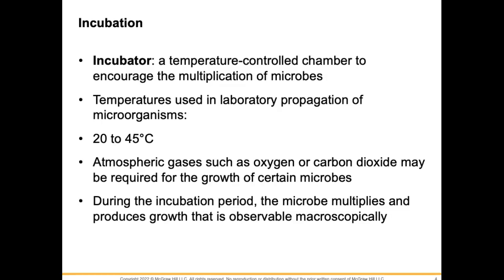We also determine the atmospheric gases that are needed for any given culture. It could be oxygen, CO2, just depends on what we're testing for. And during the incubation period, the microbes multiply and produce growth on or in that media. And 9 times out of 10, we can observe that growth macroscopically with the naked eye.